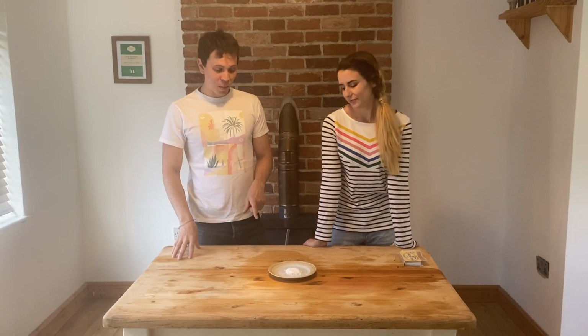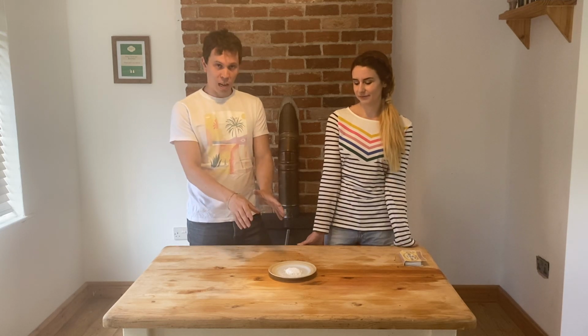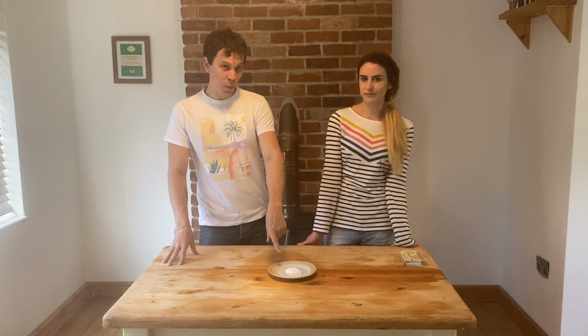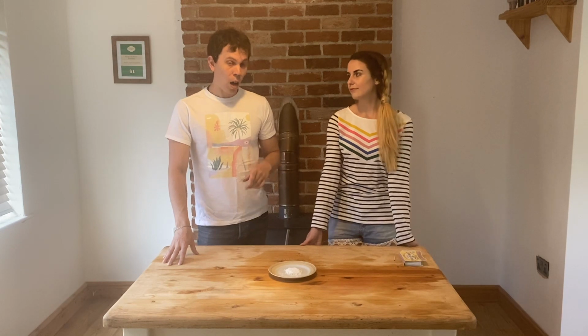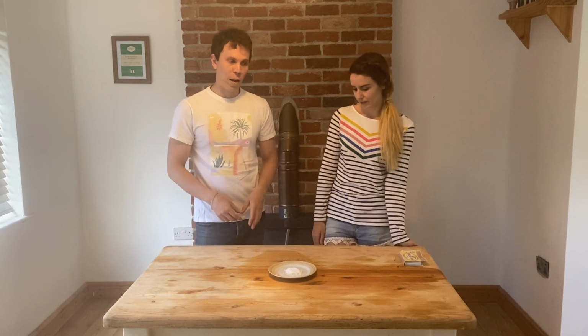So the experiment I'm going to show us now is often presented as a surprise or almost like a magic trick to people where they don't know what's going to happen. So I've got Lisa here who has no idea what's going to happen. All I'm going to say beforehand is that I've got a plate with a flammable powder on it, and I'm going to ask Lisa to light a match and set fire to the powder and see what happens. And afterwards I'll explain what's going on and what is in the powder.